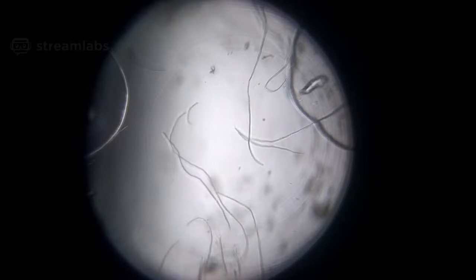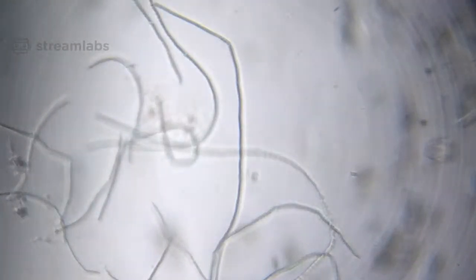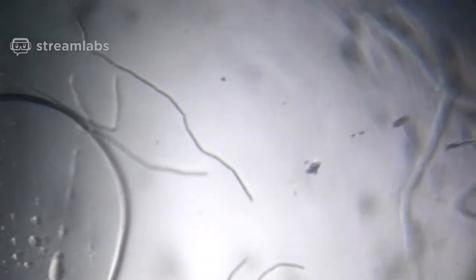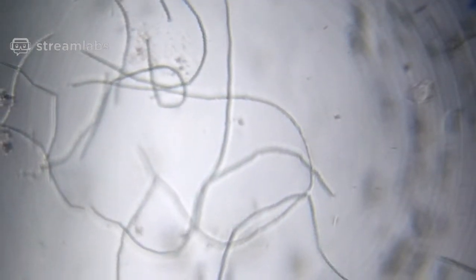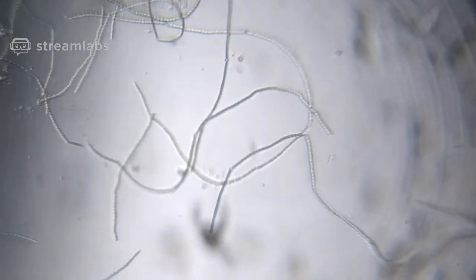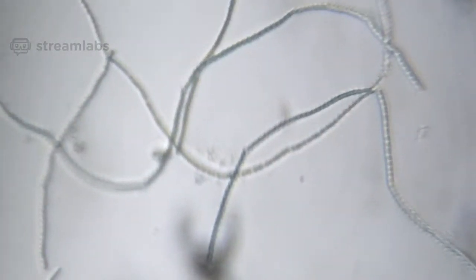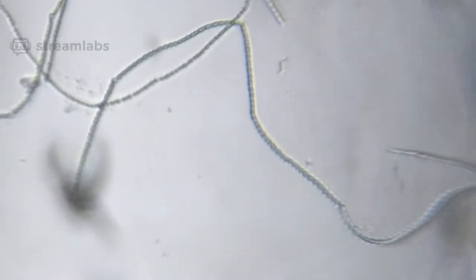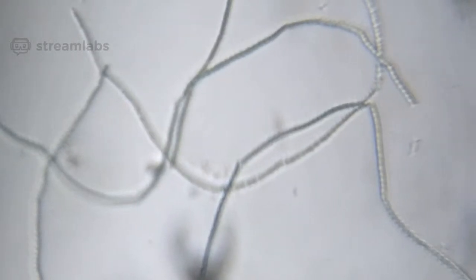Okay, so here we are. You see, this is what is called a Cyanobacterium, right? Okay, let's move around and get a good view. Let's get a good focus too. Yeah. You see these cells? What do they look like? Little chains. Do you see the chains of cells?